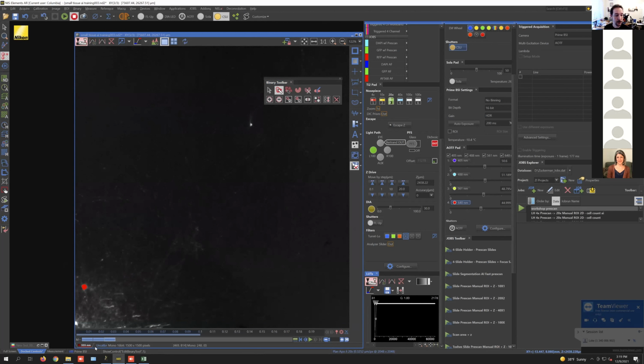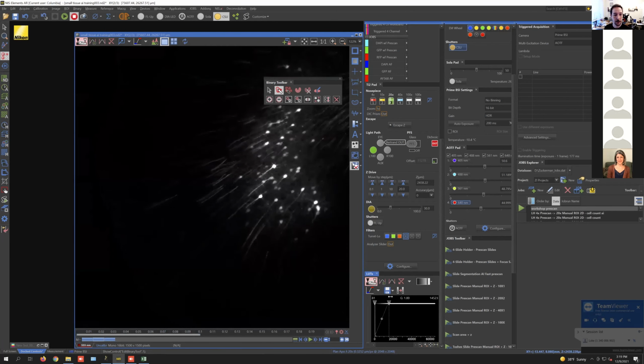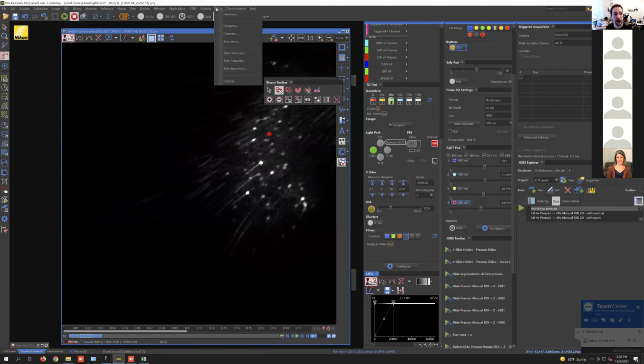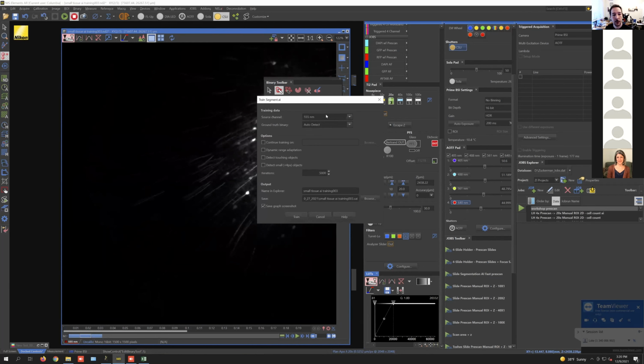Okay, so I just need to do one more in this. Obviously I would do all the cells, but I don't want to take up your time doing that. So I've at least marked every single image with some masks. Now I can go up here to this AI tool, and we're training a segment AI. Here we can train segment AI. It already knows a lot of this, so it knows the channel we're working on. We have our binary mask already.